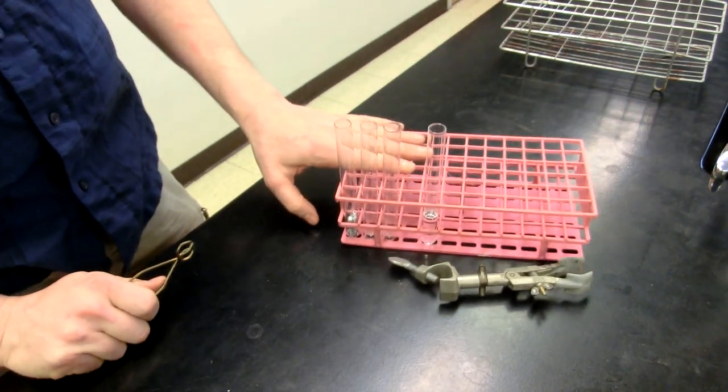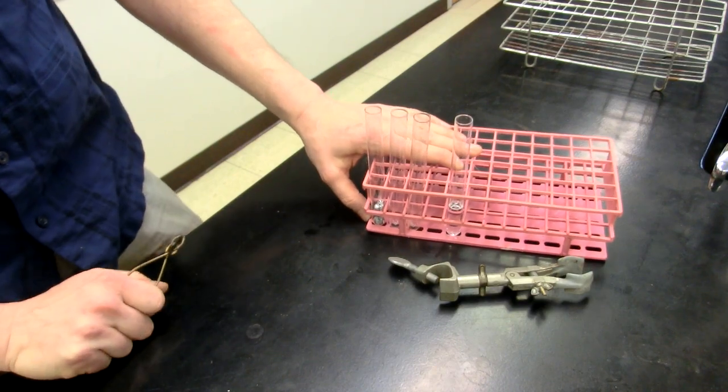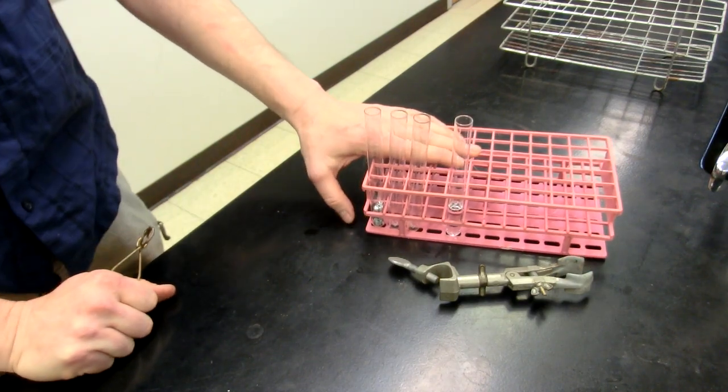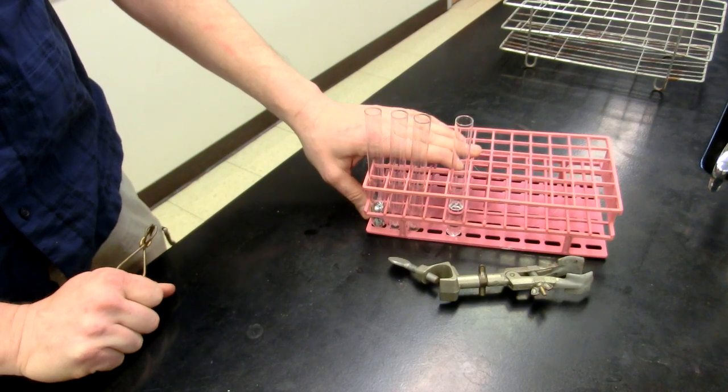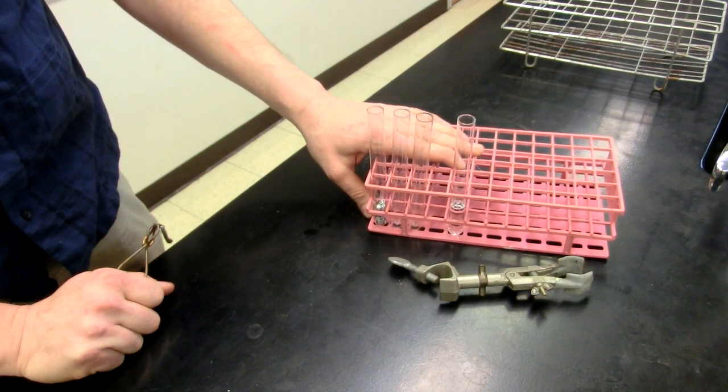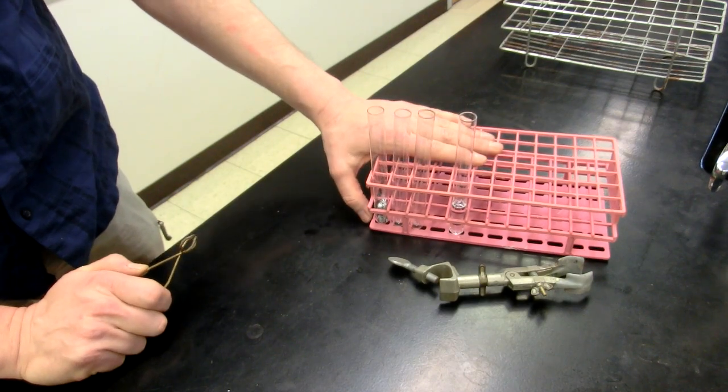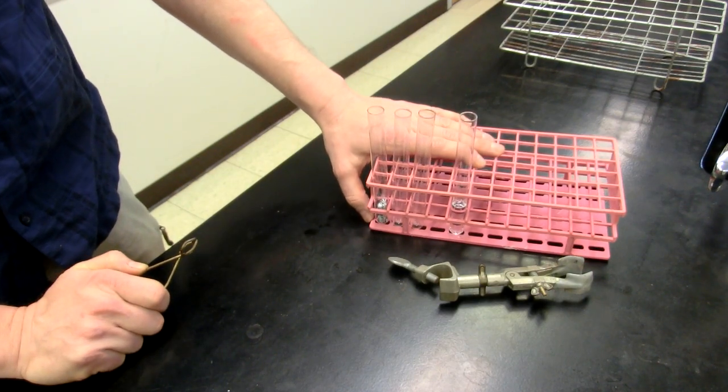This is called a test tube rack. You'll notice that I have a plastic rack. The plastic racks are actually better than the metal ones because the plastic in general is going to be less chemically reactive than the metal is going to be. So if you have the opportunity to use a plastic test tube rack, I would go with it instead.